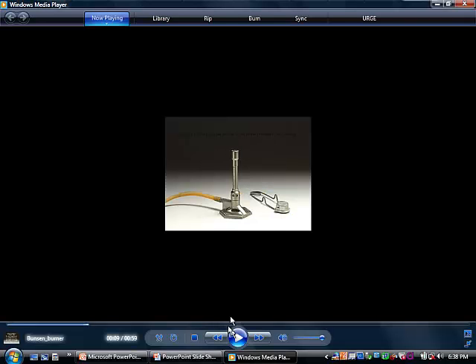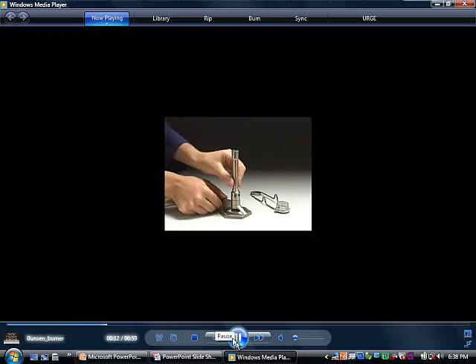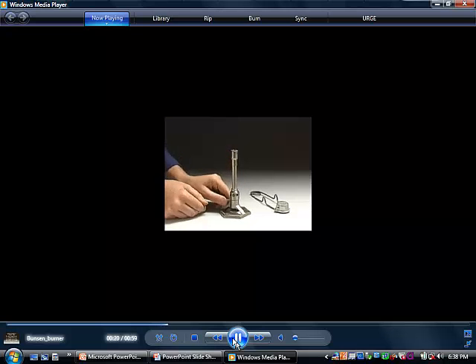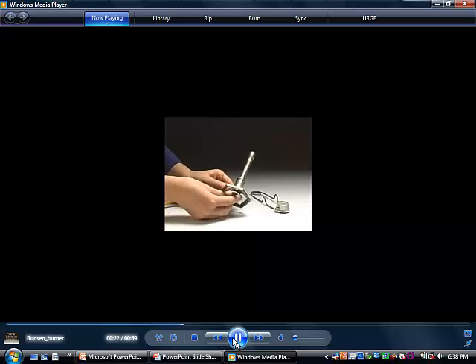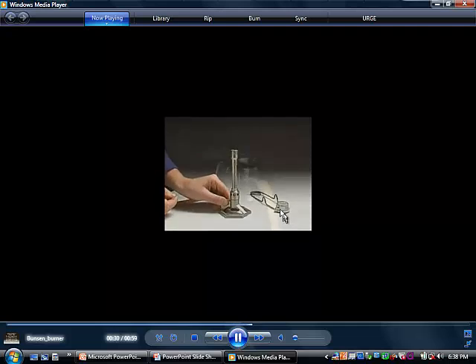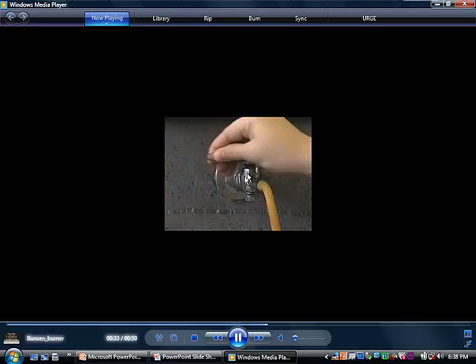We have a Bunsen burner here. Twisting there is controlling how much air. You start out with it twisted all the way over, just letting a little bit of oxygen in. Then you close the valve most of the way and just open it up a little bit on the bottom. So there's just a little bit of air and a little bit of gas coming out. You use this striker. This is the control at the wall. You turn that on all the way. Then you use the striker to start the flame.